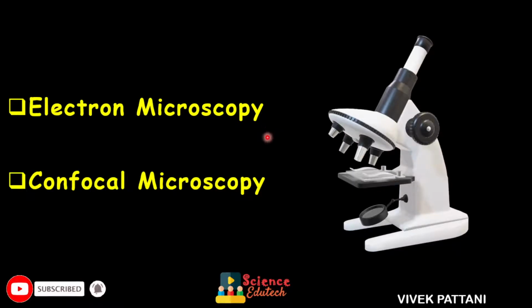So what is electron microscopy and what is confocal microscopy? I'm just going to give you basic introductions. This lecture is especially for biologists who want to study electron and confocal microscopy. Electron microscopy is a fantastic tool that enables biologists to capture images of their samples at a greater resolution than with a light microscope.